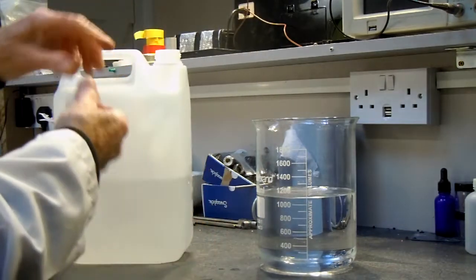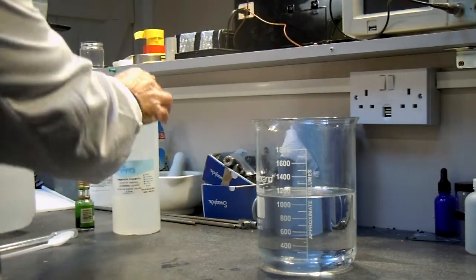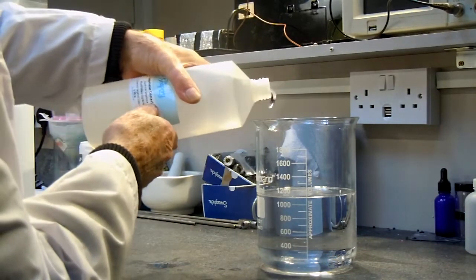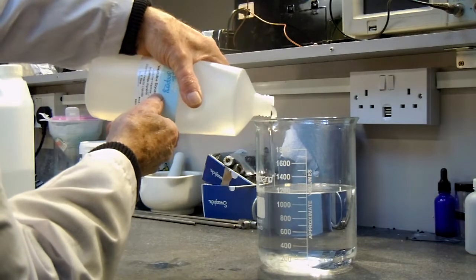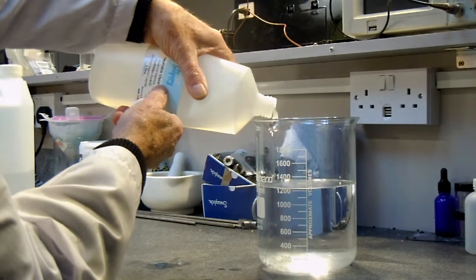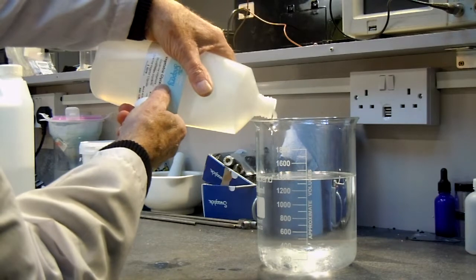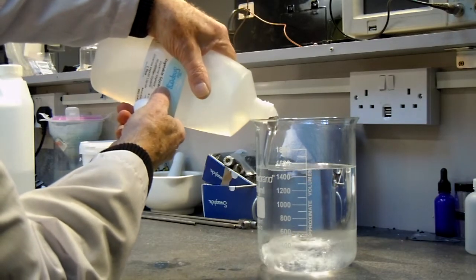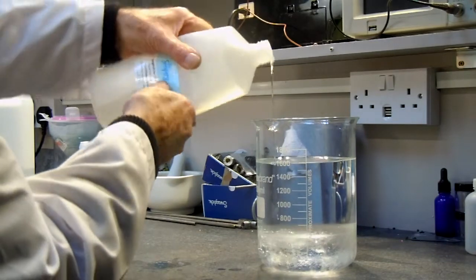1.2 litres of isopropanol, approximately, and 500 millilitres of glycerine. You might say, by the way, that you could add glycerine to taste. I think that's probably enough.